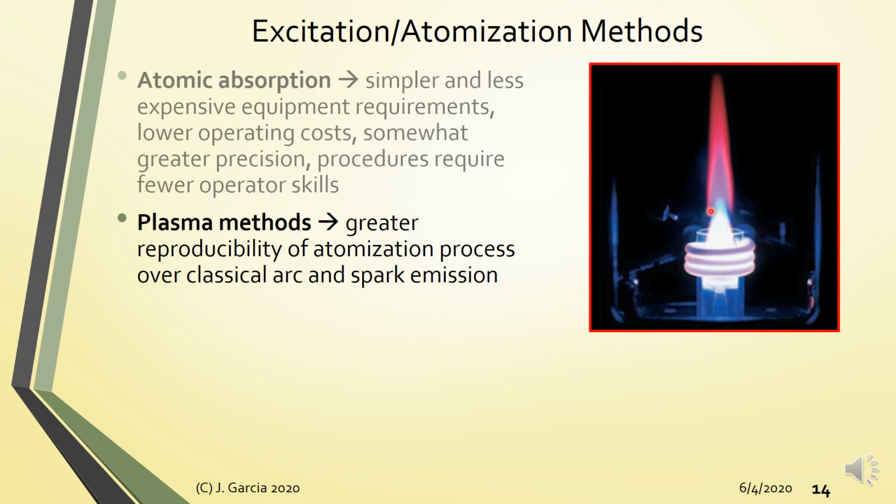All right, so a plasma is actually generated by feeding it with argon gas. Then the argon gas is in turn ionized into a plasma with the help of this RF coil. The radio frequency coil, as well as the magnetic field inside this coil tube, stabilizes the argon plasma.